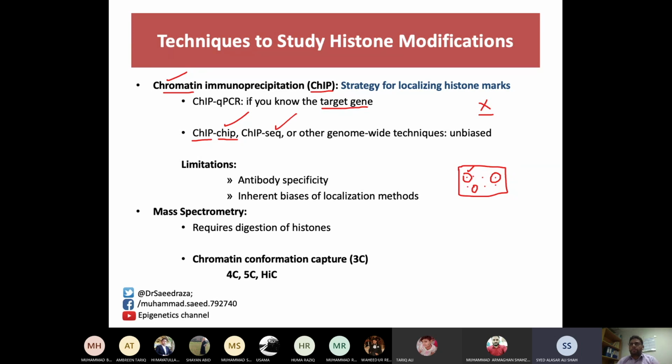But for CHIP-seq, normally we do not have a specific probe. There are universal adapters which do not care about any sequence of genes. So that means they will create different reads. So there is no specific probe for CHIP-seq.